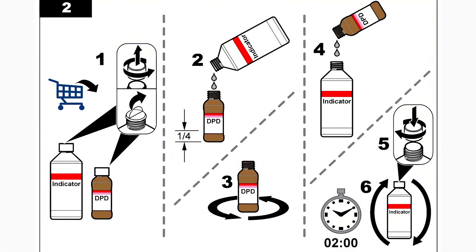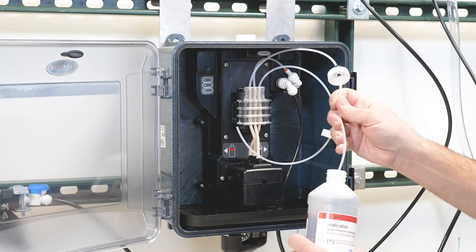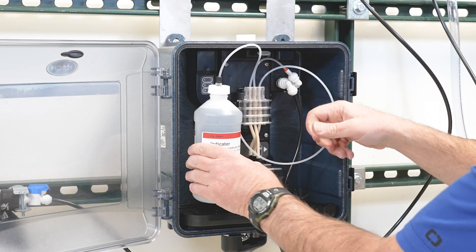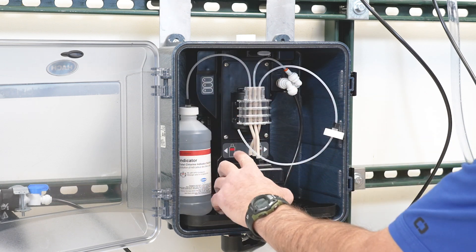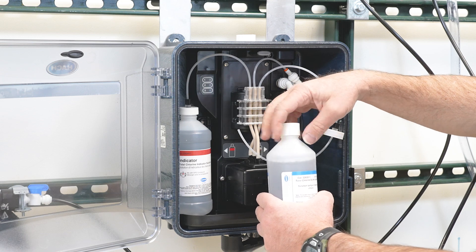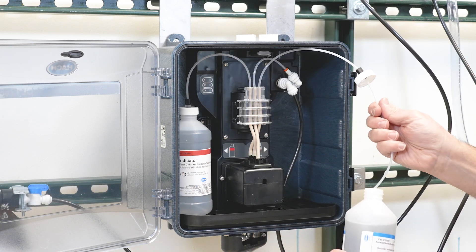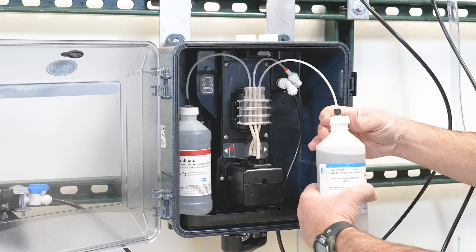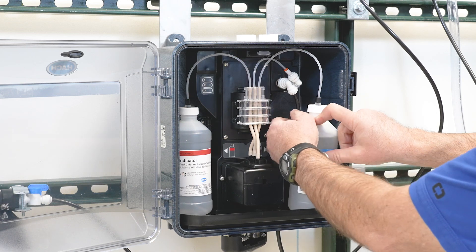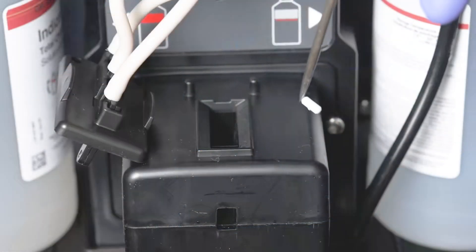Follow the steps in the user manual to mix the DPD and the indicator solution. Install the reagent bottles. Install the stir bar.